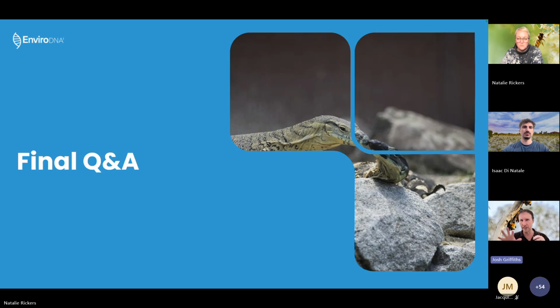Krefft's and sugar gliders have only recently been split. We probably can't differentiate between those two. We can with certain assays with squirrel and the sugar glider group, but they're very closely related. So using things like swabbing hollows or swabbing the trunks outside of hollows, thinking about their behavior and where they move along the tree to target those areas.